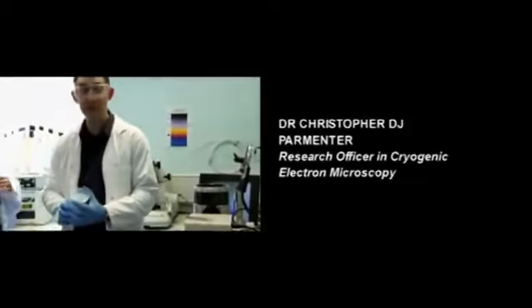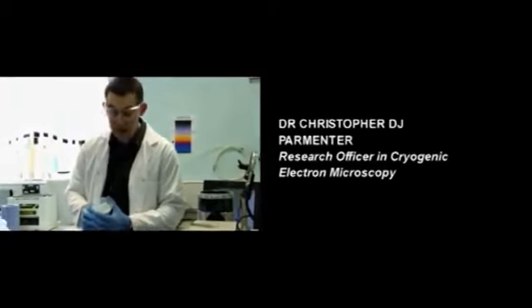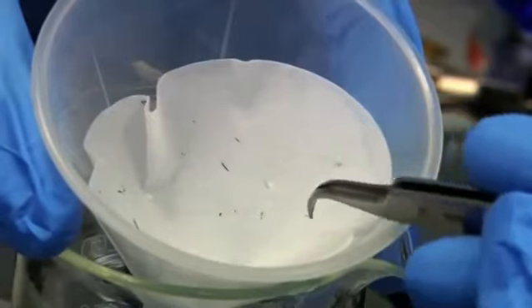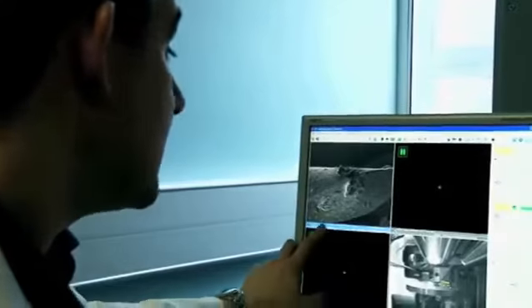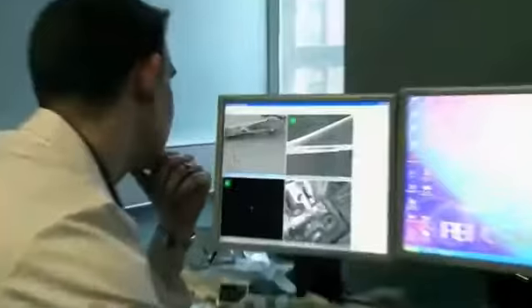We've just filtered off the water and soap and we're left with the hair, so we can put them into the microscope. From here to here it's about 250 microns, so that's a quarter of a millimeter — but for this microscope, it's huge.